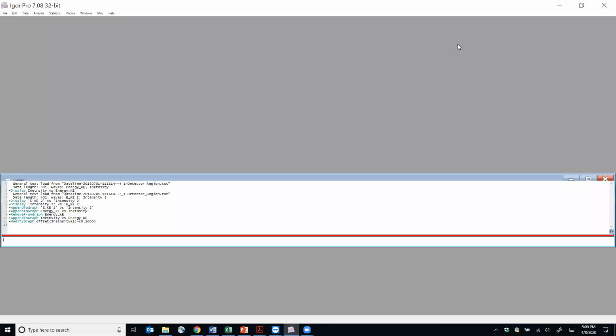The video? Oh, I will record. Yeah, recording, so I can use it maybe in the future for another user. Okay.